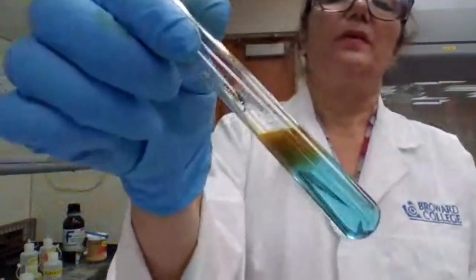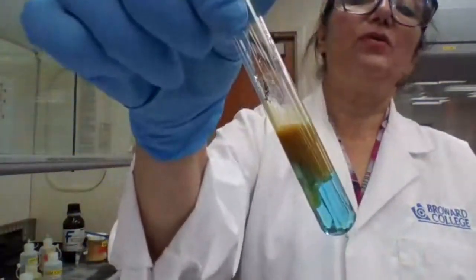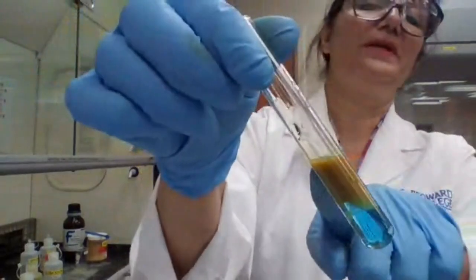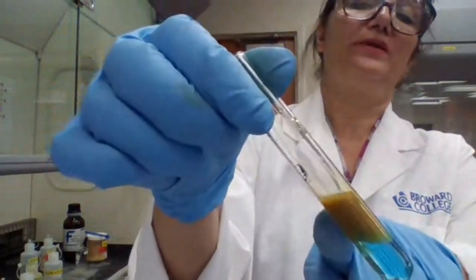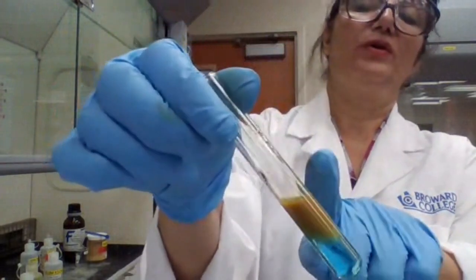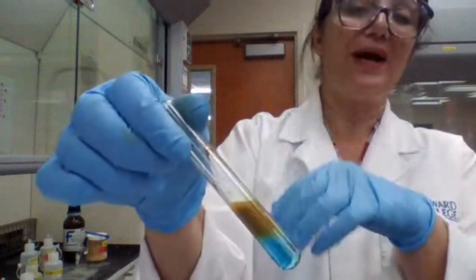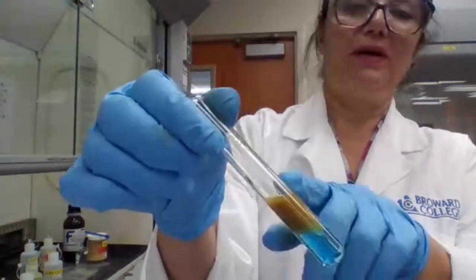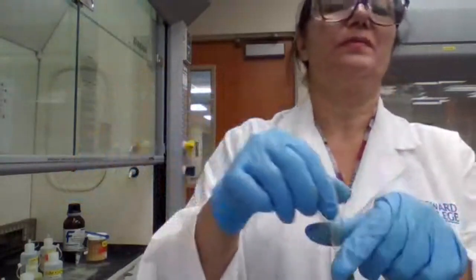So you see that new color, the maroon color, or record the color in a way that you recognize it. The precipitate formed because it's cloudy, and that is the new color, the maroon color that you have. So you record this because when you see the unknown, if you have copper, that's the color you're going to see. It may not be the exact same color, but very close to this color for your unknown.